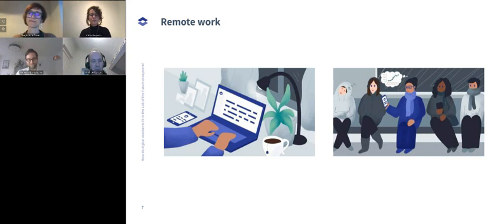If we can have that brought together by an assistant, preferably an intelligent assistant, that can say, okay, the water bath temperature parameter's okay, I won't phone Andrew just now or notify him that there's a problem. Or, no, there's a serious problem and this does warrant intervention. Here's the link to the webcam to show you exactly what's going on. Would you like to make a change? I think that's where an assistant could help you out.